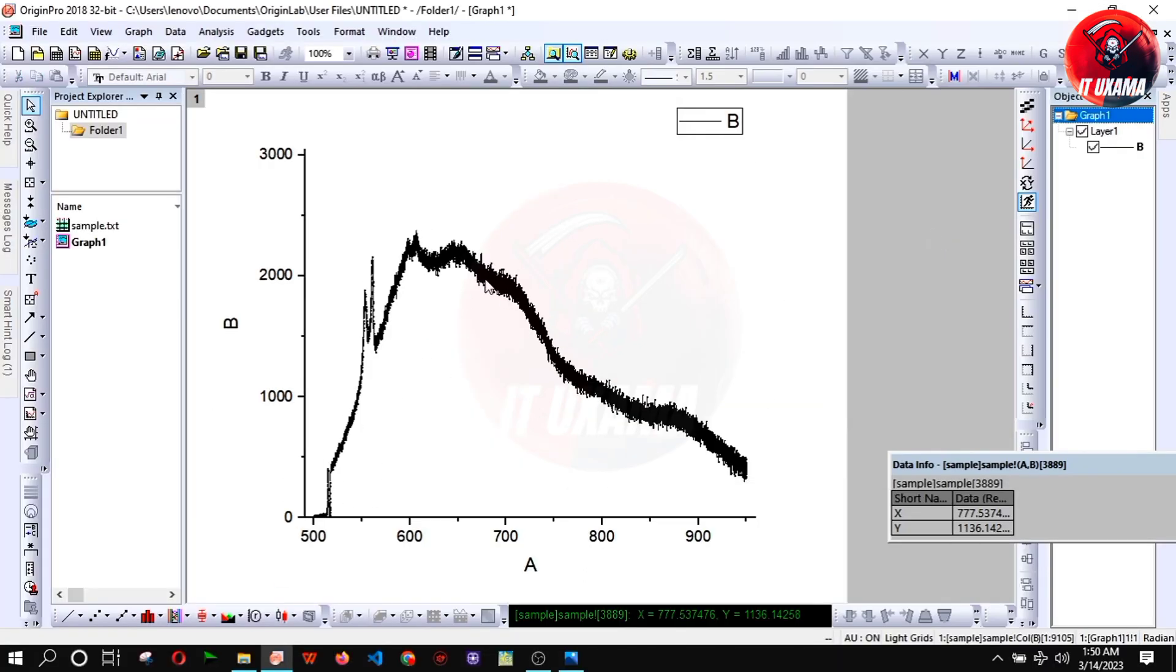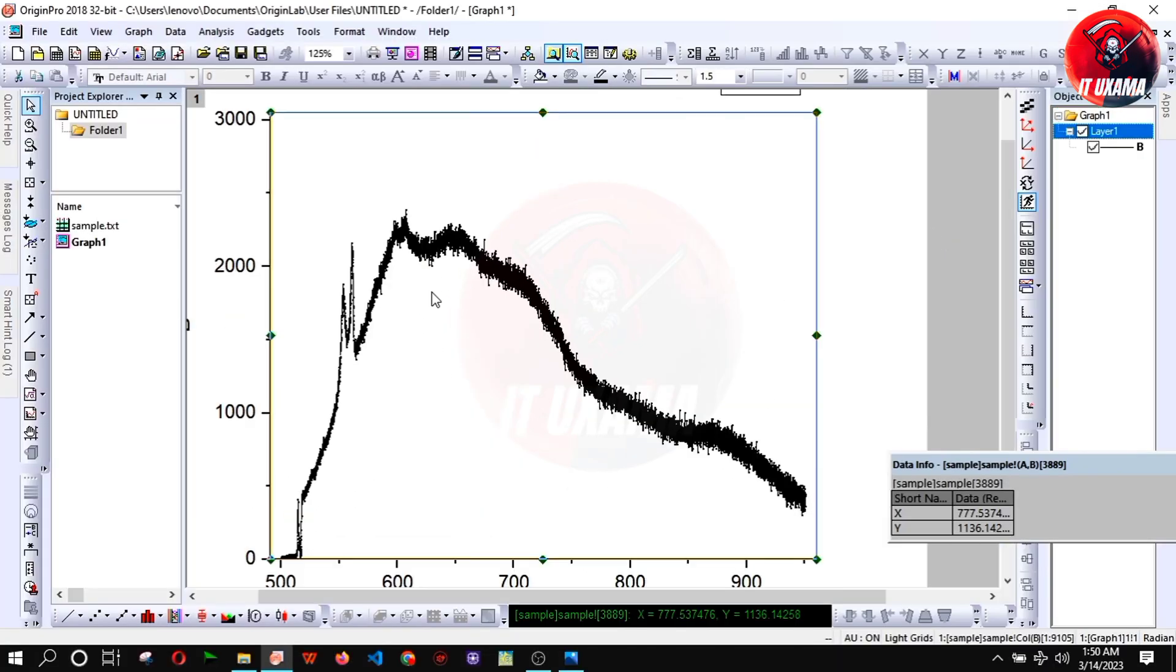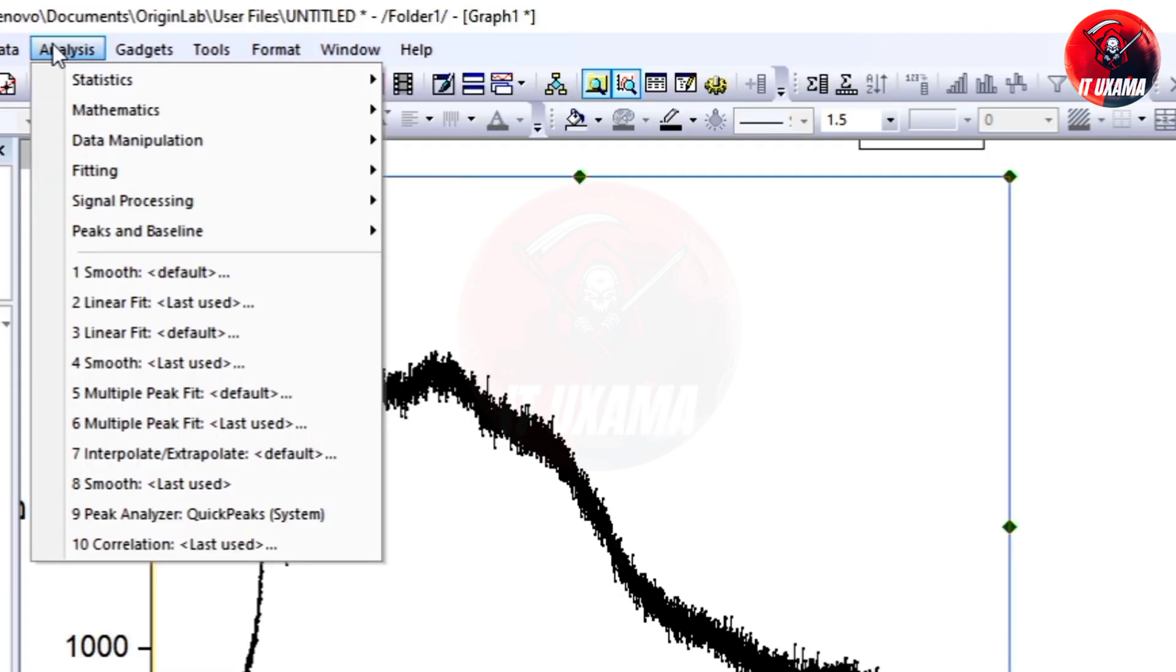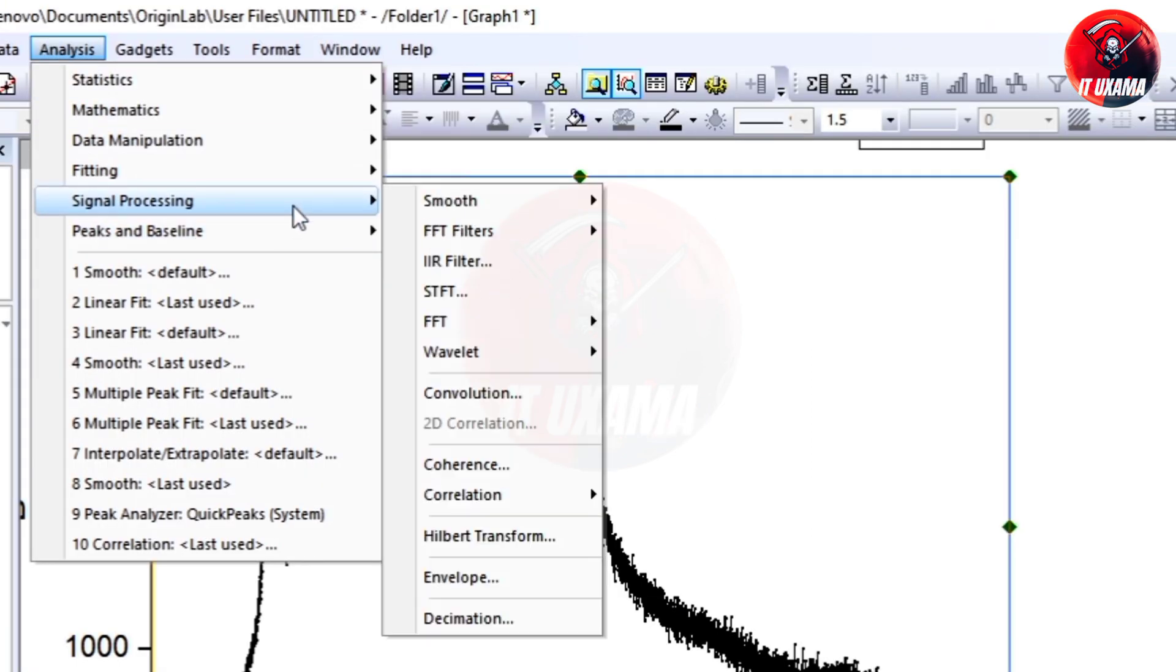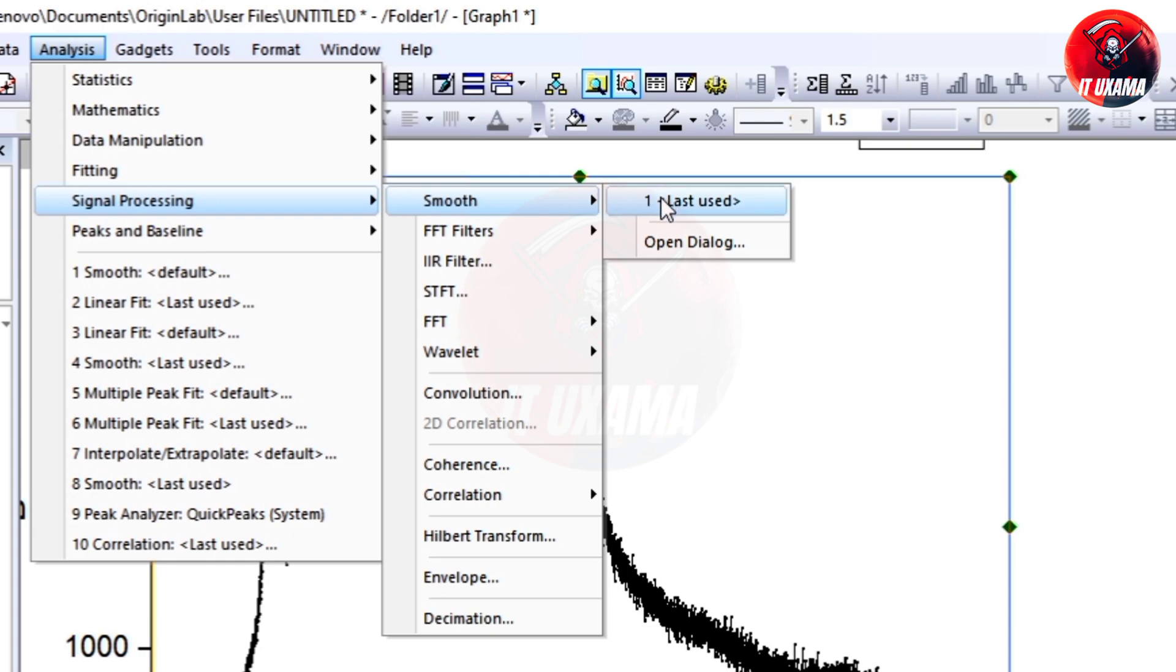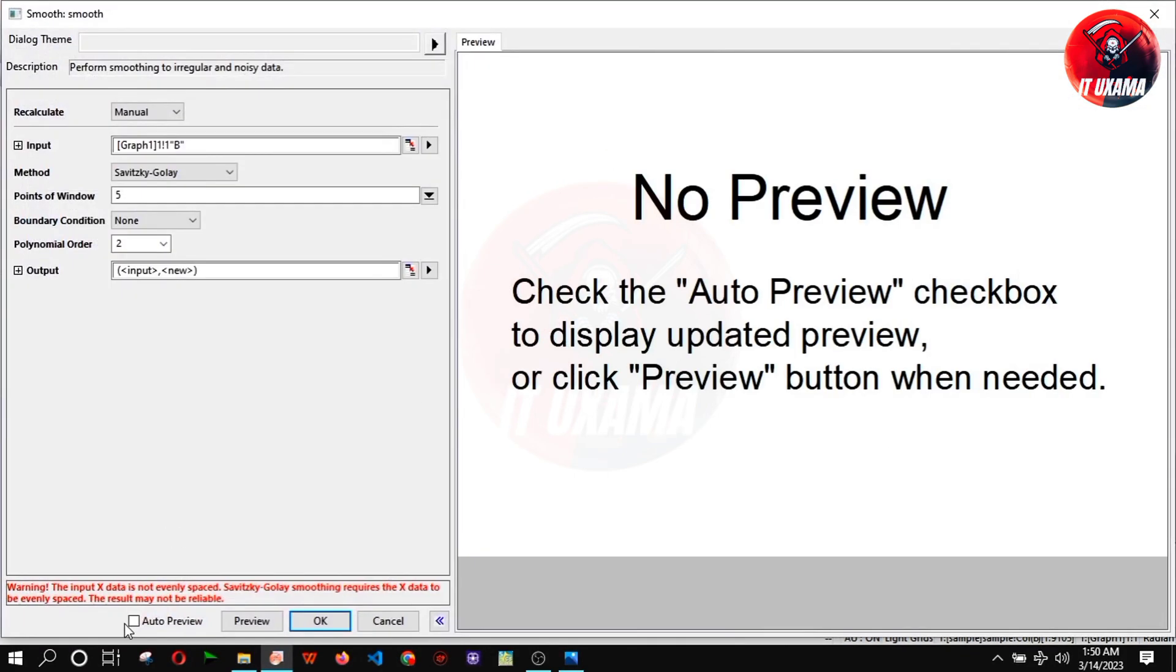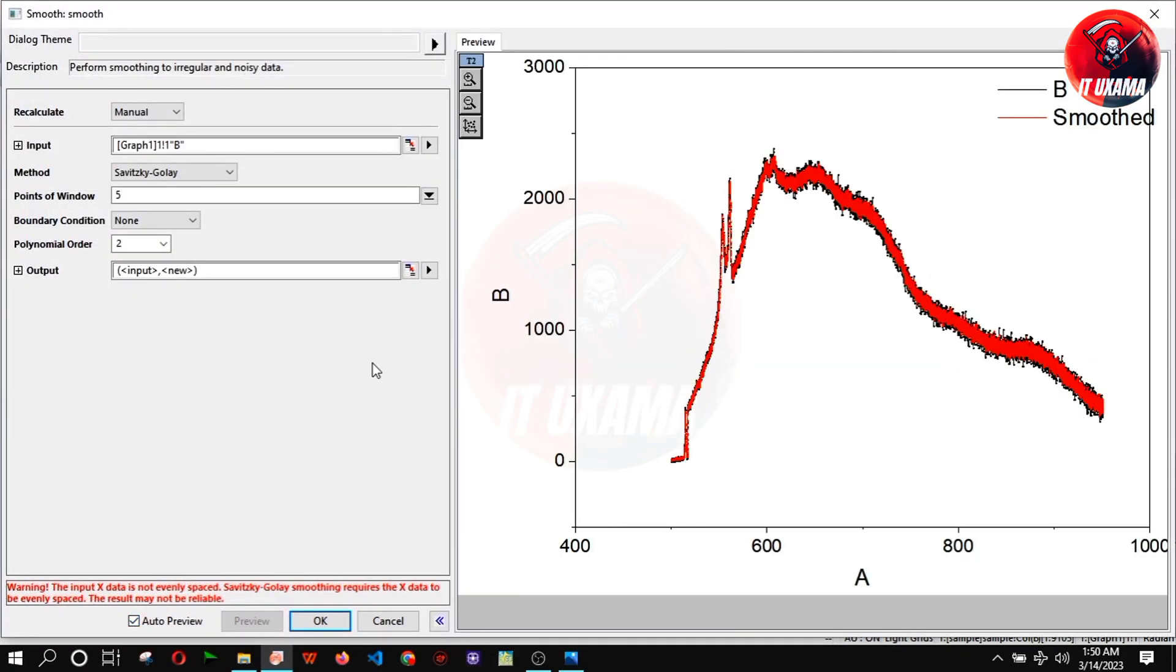Zoom into the graph. Now go to analysis on toolbar and select signal processing. Then smooth and click on open dialogue. Now turn on auto preview to see live processing. Again scale in the graph.